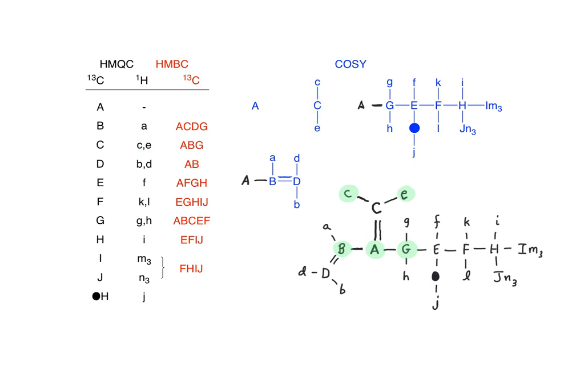We can and should look at the remaining HMBC correlations to make sure that confirms what we know from HMQC and COSY, and I will leave that to you to do on your own for practice.